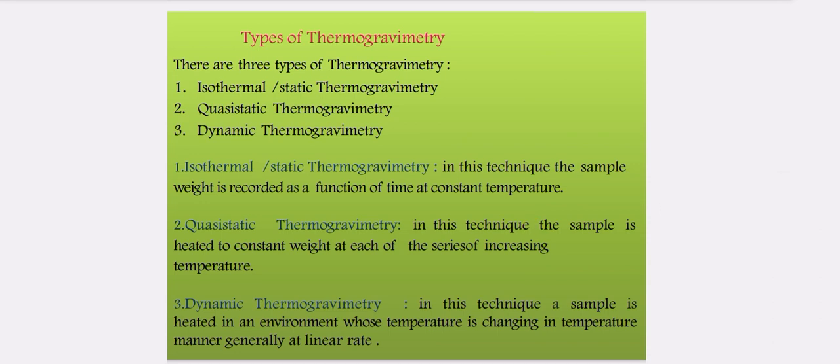First is isothermal or static thermogravimetry, quasi-static thermogravimetry, and dynamic thermogravimetry. So isothermal or static thermogravimetry means in this technique, sample weight is recorded as a function of time at constant temperature. Means here at the constant temperature, the sample weight is recorded or examined.